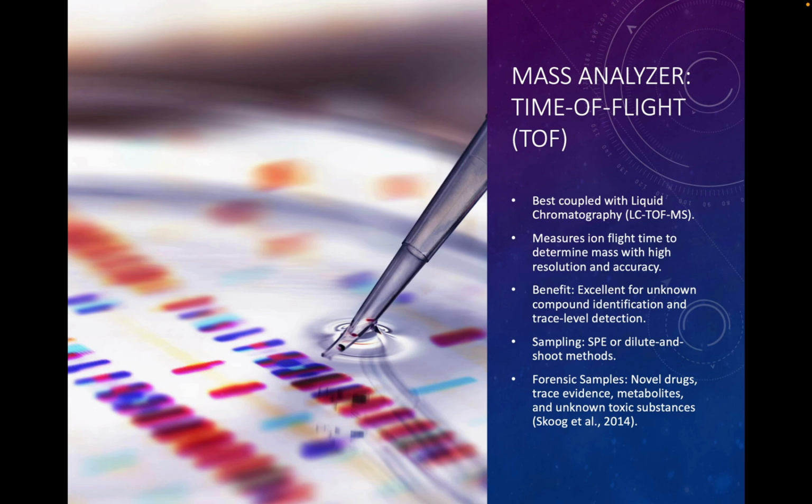Mass analyzer: time of flight. The second mass analyzer is time of flight, or TOF, which is best paired with liquid chromatography, so LC-TOF MS systems. I read that TOF analyzers are known for their high mass accuracy and ability to identify unknown compounds.